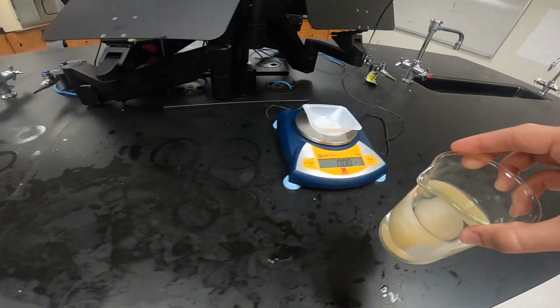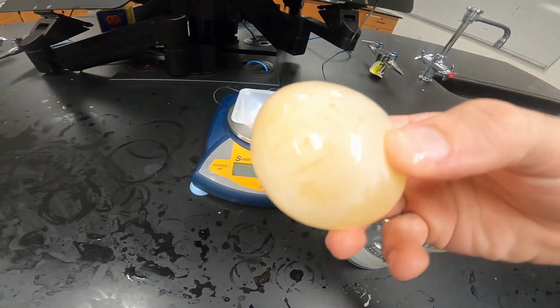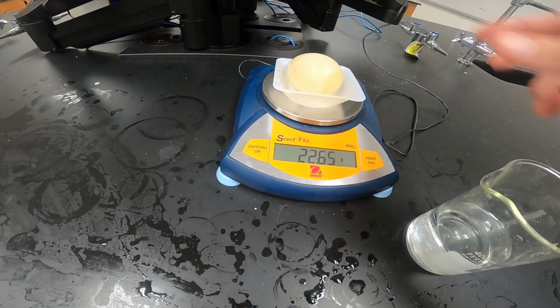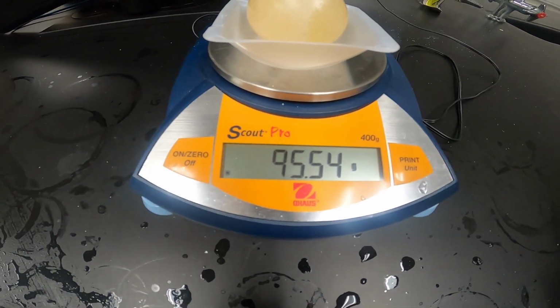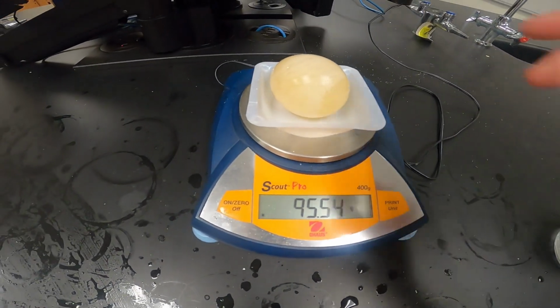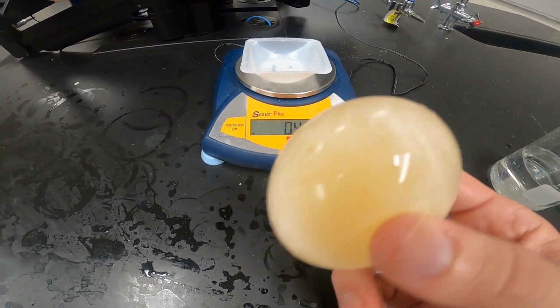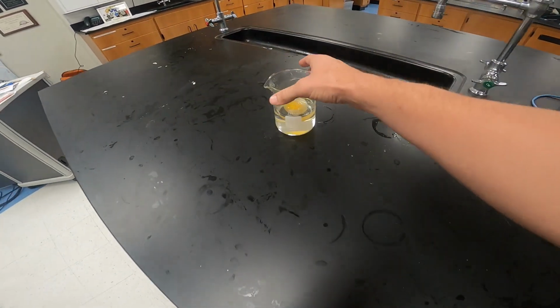So starting with our water egg, again we pull it out, you can see it's gotten larger than when we started. And now we're at a mass of 95.54 grams. So that's for our water egg. And again, you can see it's gotten much larger, much thicker in size. So we had that change in size.